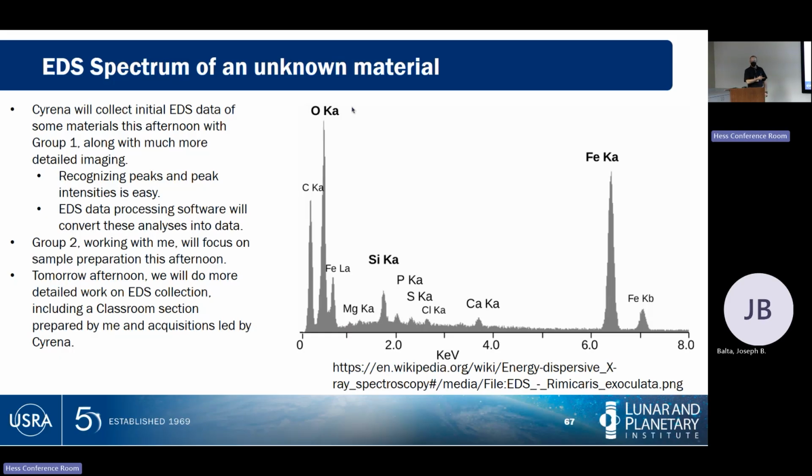Recognizing peaks. Once it tells you the energy, you can actually do this almost by eye. If you know where to look on here, you can even recognize phases by the ratios between these peaks just by looking at them. You won't even have to do any math. It can be quick enough on that. There is plenty of data processing software built to work with these types of analyses.